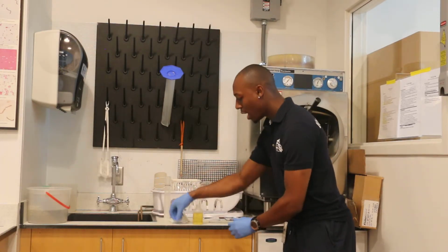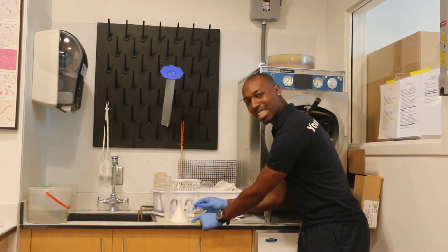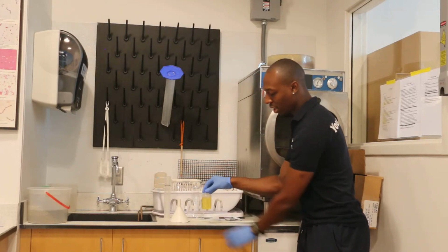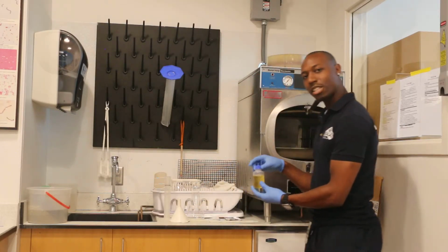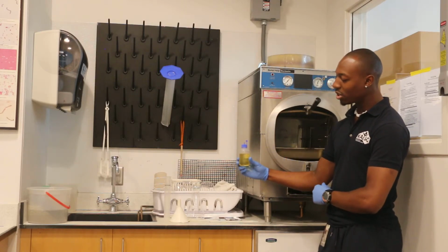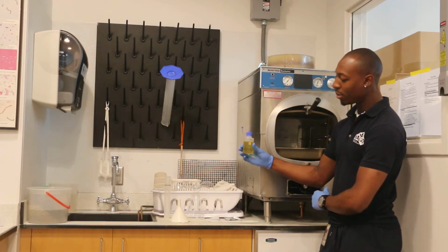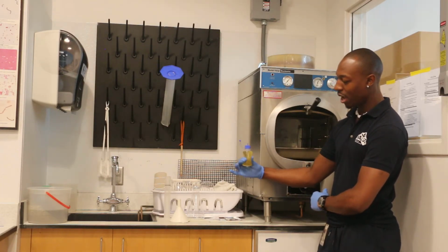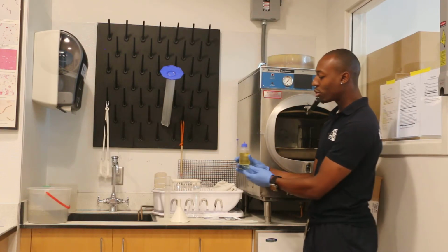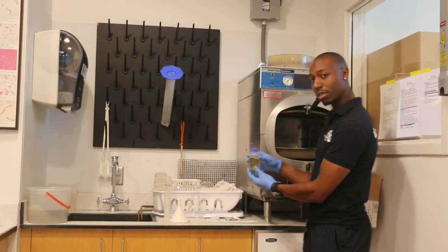After I'm done with that, I want to make sure my top is on, okay? Now, I'm going to tighten it all the way on, and then I'm going to loosen it just a little bit. So it's just enough. Why do we need that space? Well, because we don't want the condensation to squeeze the bottle. There's times where people have actually closed the top all the way and the bottle has been autoclaved and it actually squeezed out just like so. We don't want that to occur, okay? So make sure that there's space, the top is loosened.